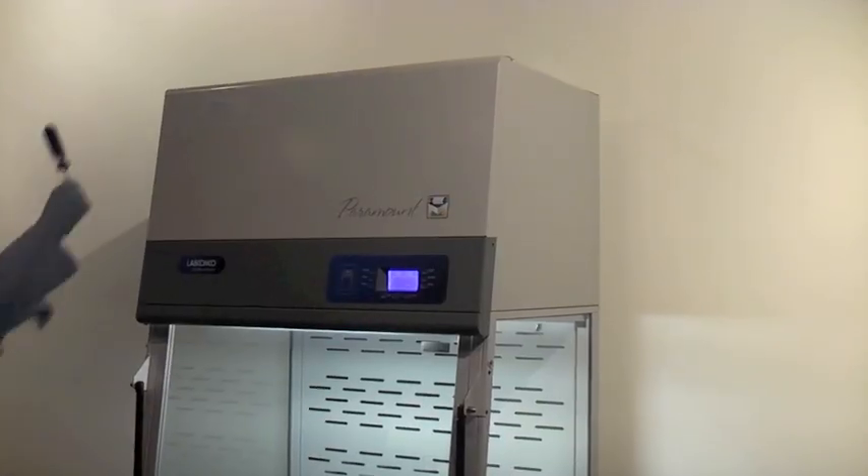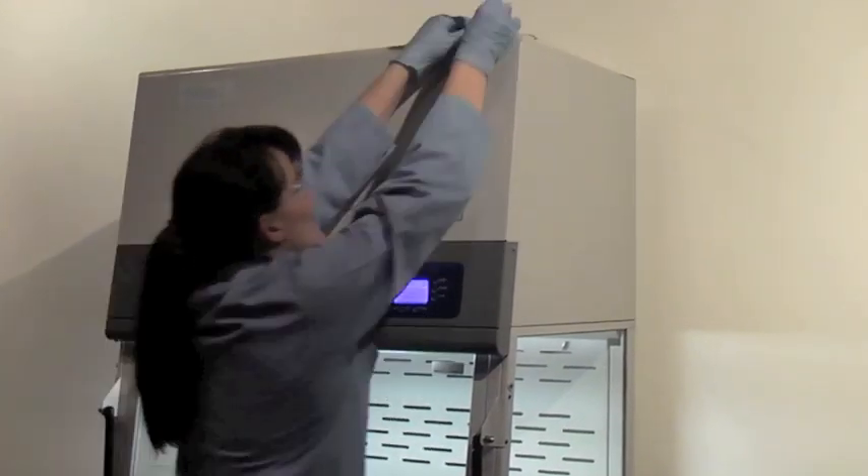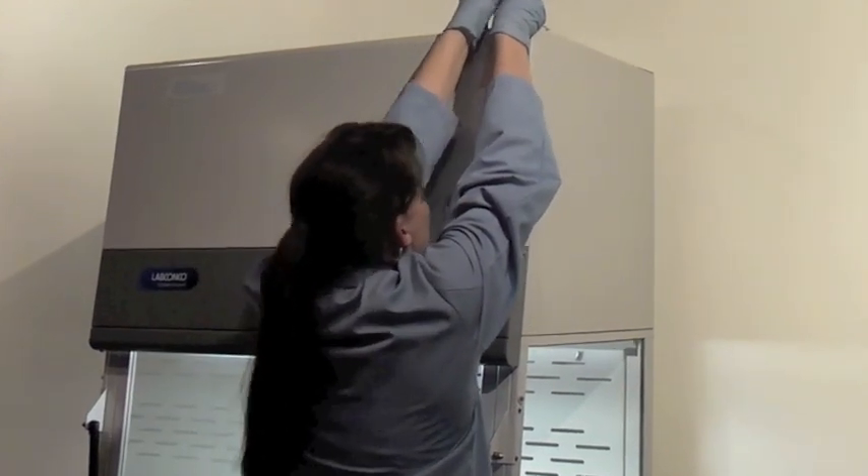First, remove the front panel. Use a Phillips screwdriver to loosen the two screws holding the panel in position, then slide the panel forward and up to remove.